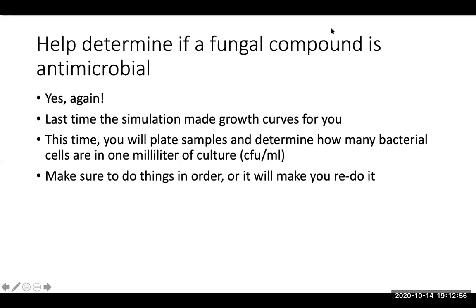So the lab starts out with the same scenario as the last one, where there's some new fungus discovered and you want to see if the compound's antimicrobial. In the last lab, they made a growth curve for you. And in this lab, you have to take samples and count. You plate it and then you count the colonies that form. So a different approach to learning about bacterial growth.